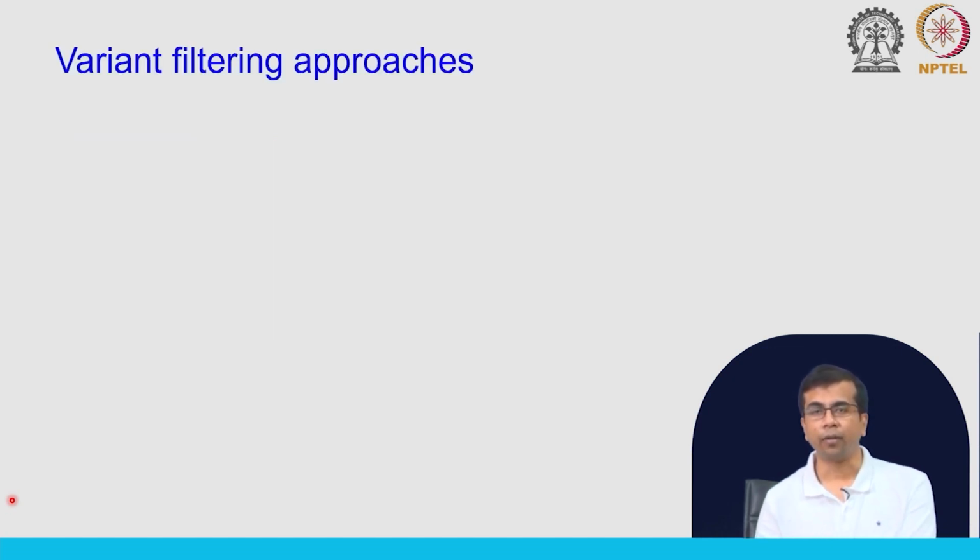So, what we will talk about now is something called variant filtering approaches. There have been a lot of these variant filtering approaches developed. Again the goal is to identify the true variants and reduce the number of false positives. When I say false positives, these are not actual variants that are present in the sample, but they are called because of errors or artifacts in the data. They generate these false results, and we want to minimize the number of false positives.